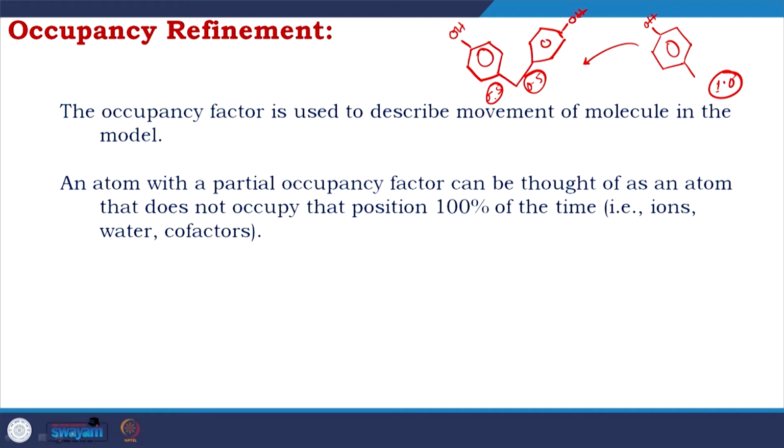Also, here I have to tell you a very interesting concept. The software has acceptance limits, so it would consider a conformer only up to a certain level of intensity it is providing. What I mean by that?